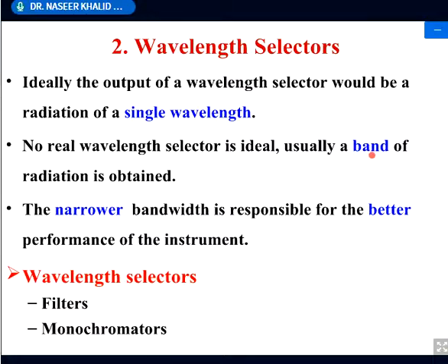It is even better if it is 40 to 42 nanometer, as compared to the 40 to 50 or 40 to 80 nanometer. So the narrow bandwidth is better, rather than a broad band.